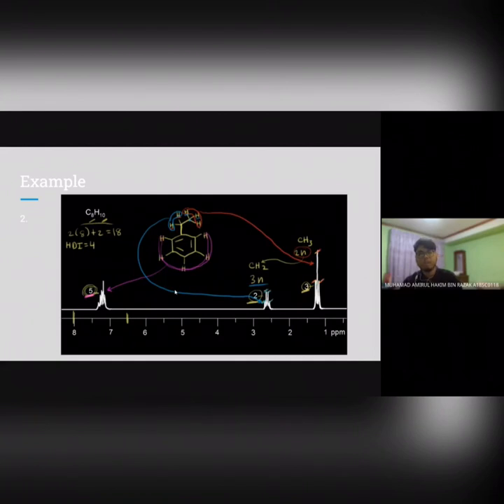Okay, so sebelum korang confident dengan jawapan korang nanti, so korang kena check balik nilai carbon dan hidrogen yang ada. So kita ada C8H10 supaya kita tak sesat lah. So C8H10 kita ada C8. So kita kira sama-sama. So 1, 2, 3, 4, 5, 6, 7, 8. So C cukup. And then kita kira H pula. So 1, 2, 3, 4, 5, 6, 7, 8, 9, 10. So cukup. Kita pun dah confirmkan peak neighbor dengan nilai proton. Dan kita pun dah confirm nilai carbon dan hidrogen. So inilah molecular formula terakhir yang kita dapat untuk C8H10. So terima kasih semua kerana mendengar.